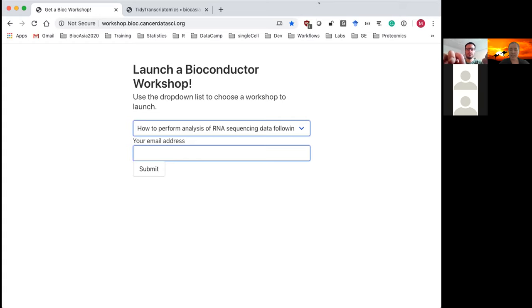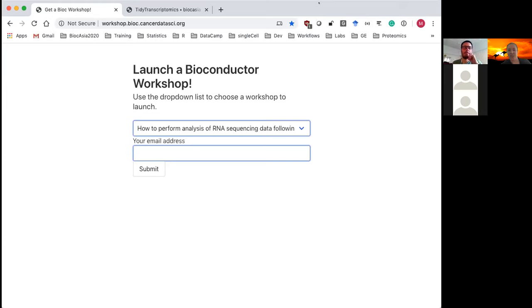Today's workshop is hands-on demos — I'll be demoing using an R Markdown document and you're free to follow along. You can ask questions at any time in the Zoom chat. In Part 1, I'll show you how to analyze bulk RNA sequencing data using a new Bioconductor package called tidybulk. In Part 2, Stefano will show you how to analyze single cell RNA sequencing data using a package currently called tidySCE. The workshop is less than an hour, so this is just an overview.